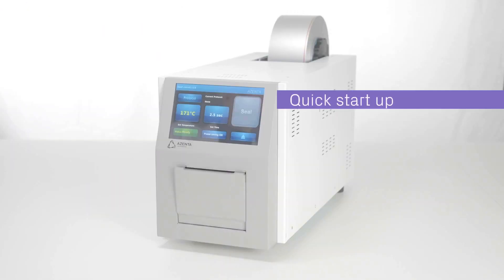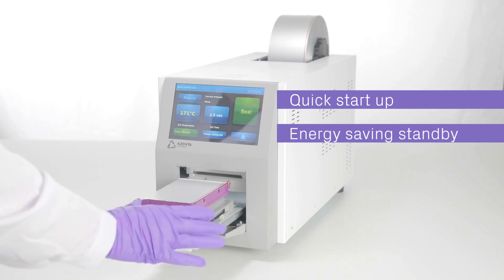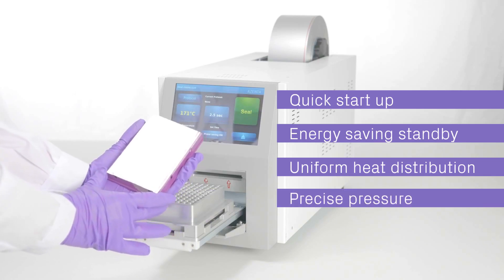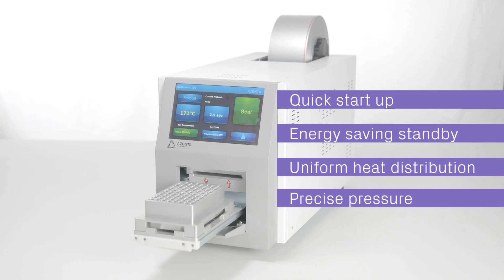Installation is fast and flexible. Its rapid heating element enables a quick start-up, while the standby function saves energy when not in use. Achieve consistent sealing every time, ensuring the integrity of your samples with uniform heat distribution and precise sealing pressure.